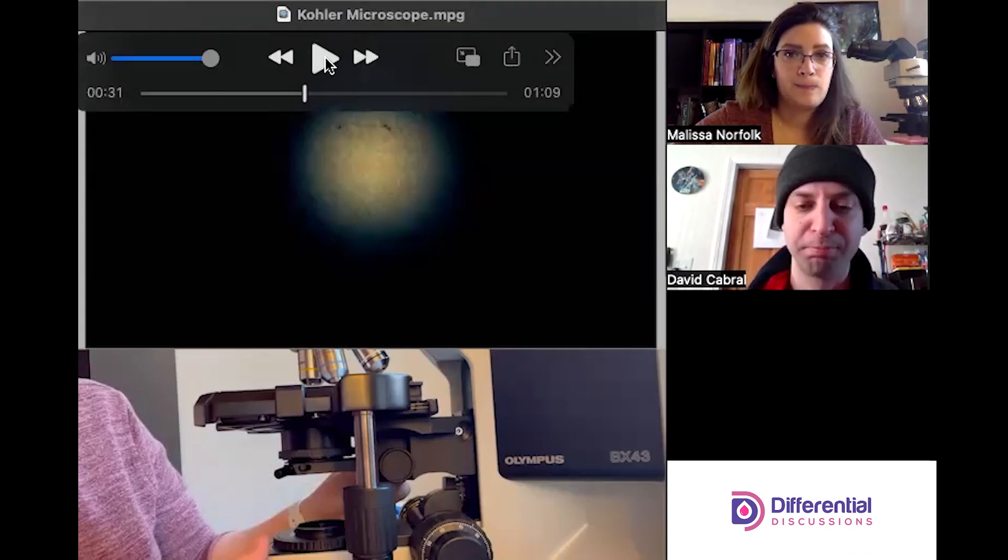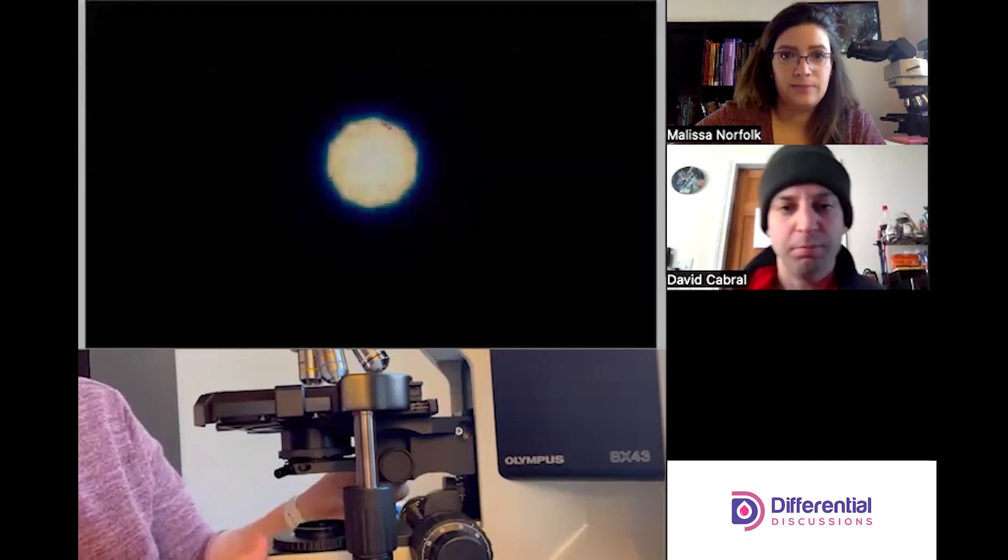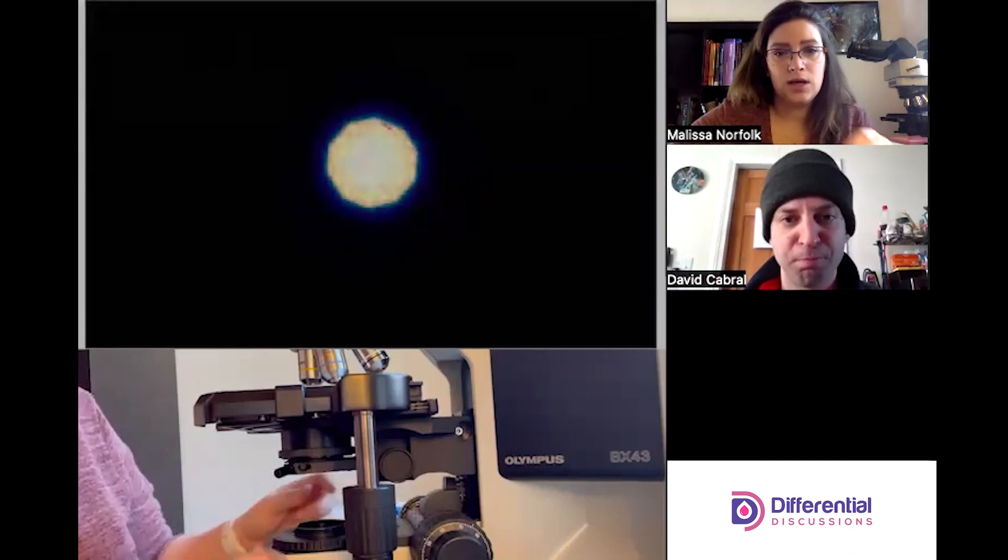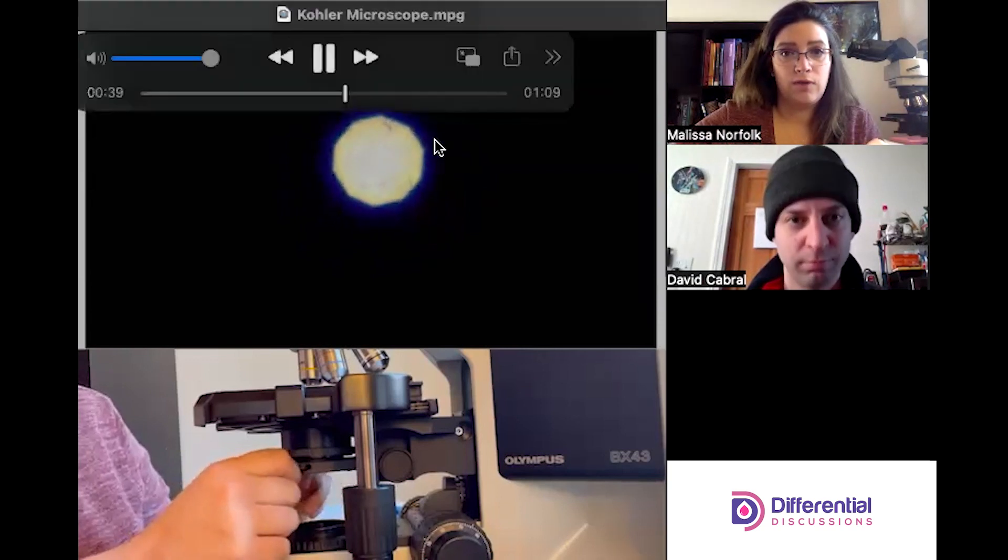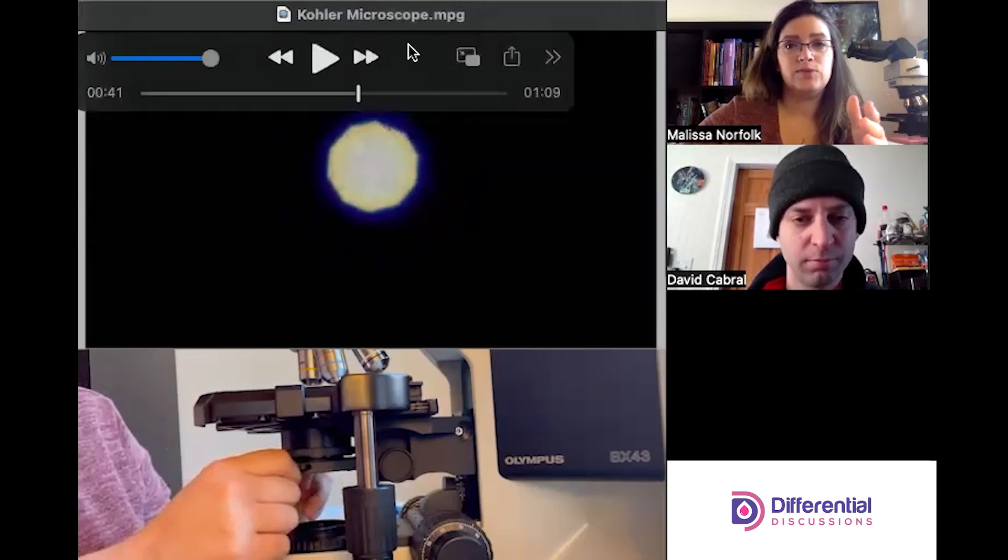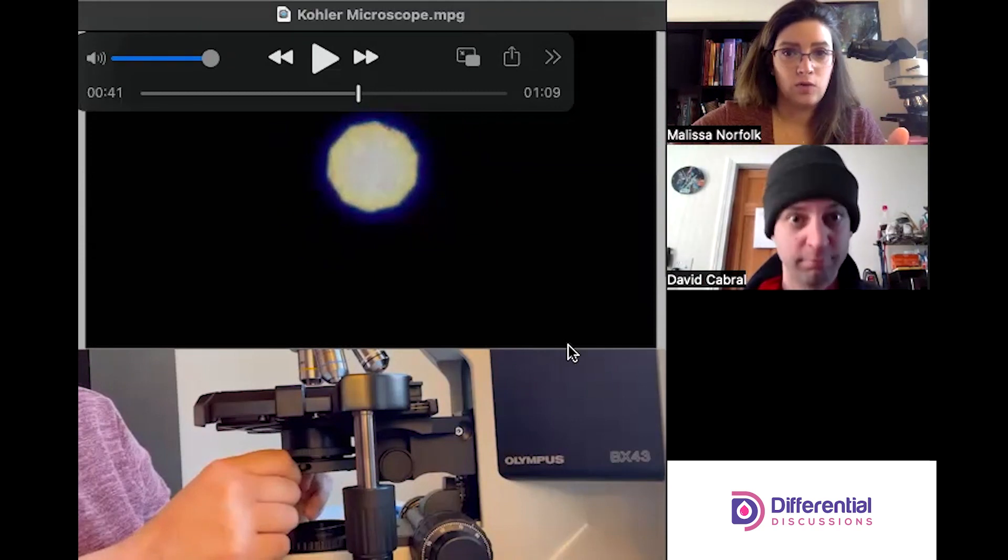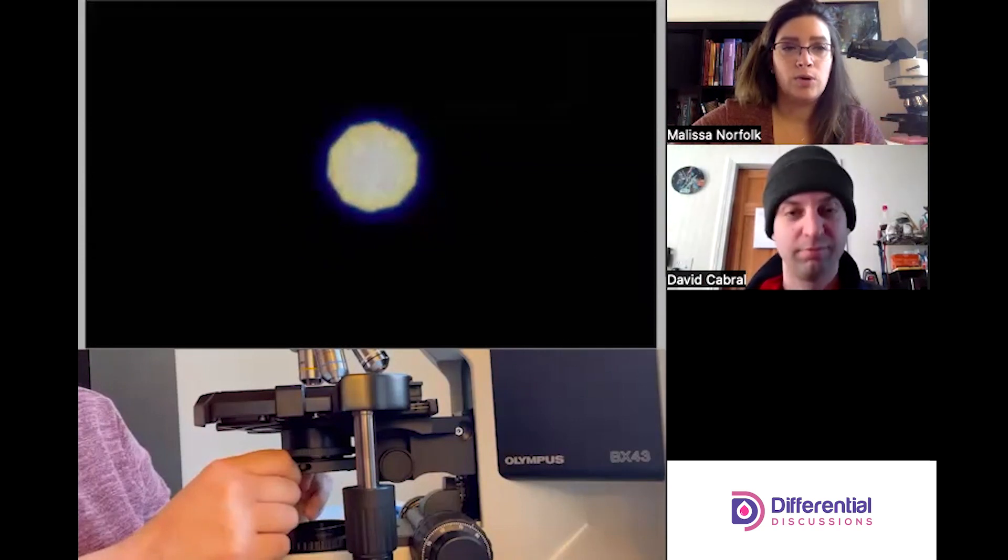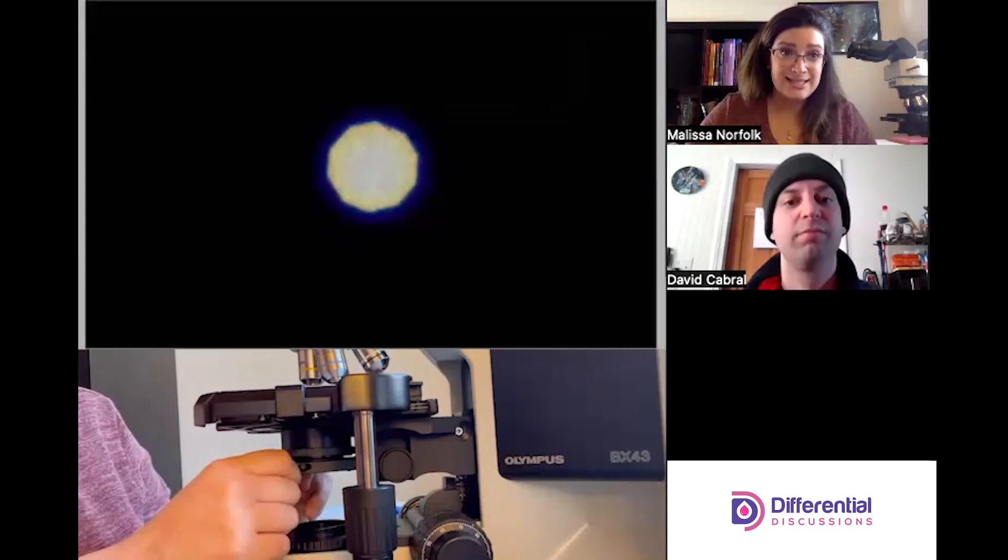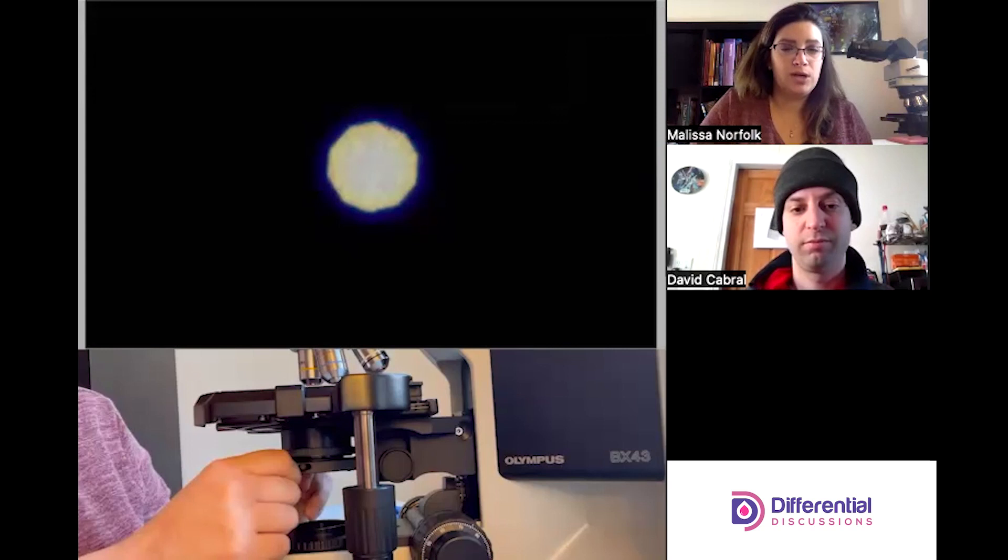I keep playing with it, I bring it back. The other thing that I play with are the condenser knobs to move around that geometric shape. Sometimes you'll come to the microscope and if someone's touched it or moved something, you could find this geometric shape over here or over here or somewhere, but you want it directly in the center of your field of view when you're looking inside of the oculars because you want the light centered.